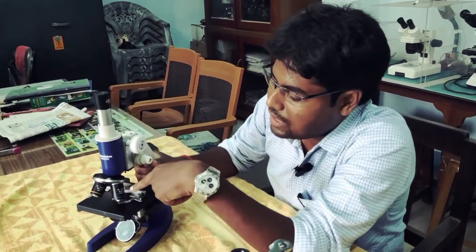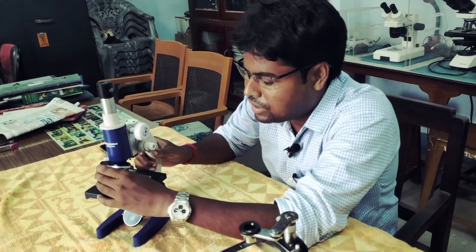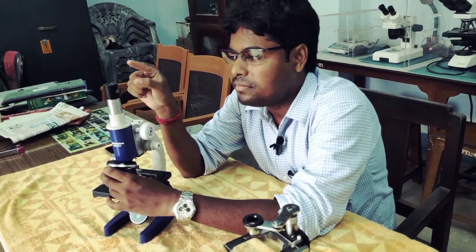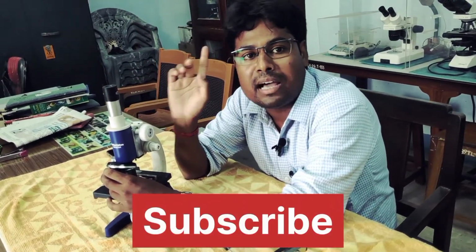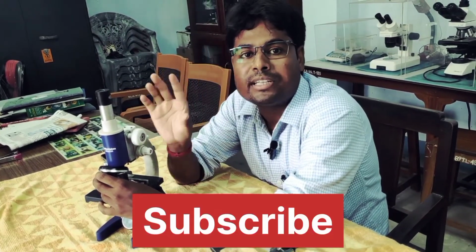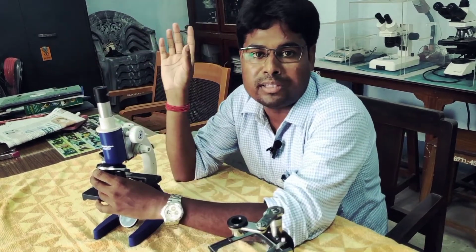So this is the objective lens, and here we set the 40x. Suppose we set the 40x here, and the eyepiece is 10x. So 10 times 40 means 400 times larger than the original size, and we can see our target tissue or microorganisms.